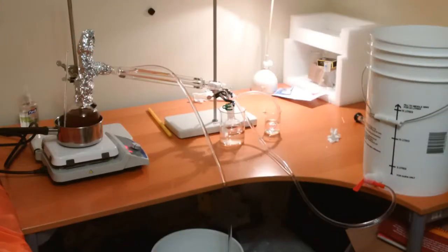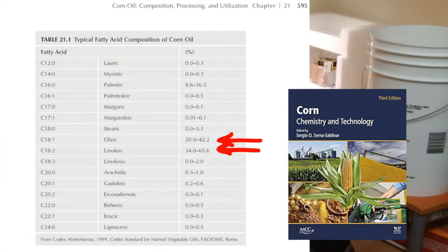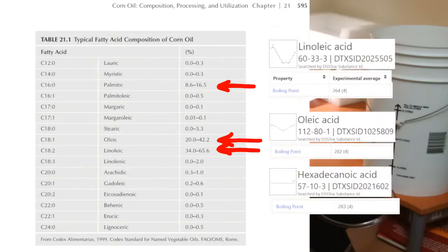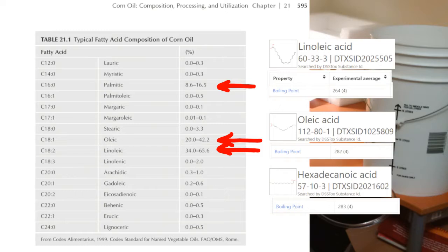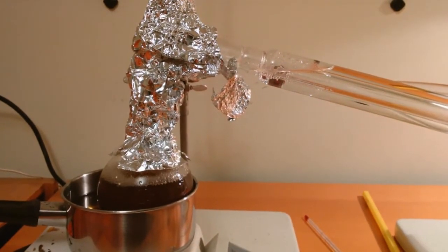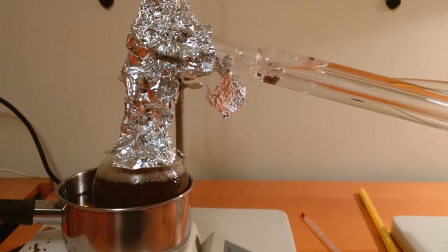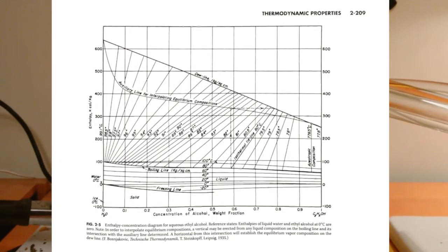On the bottom side, I placed a boiling flask in a hot bath full of Mazzola brand corn oil heated by a hot plate. According to the book Corn, Chemistry and Technology, published by the American Association of Serial Chemists, the main constituents of corn oil are linoleic, oleic, and palmitic acids. From the data at the Environmental Protection Agency's Comptox database, these materials have an atmospheric boiling point of 264, 282, and 283 degrees Celsius respectively, which means that I could get the beer to at least 100 degrees without the oil vaporizing into my bedroom. Here in the middle of the distillation, you can see that I achieved a rolling boil in the boiling flask. Watching this now, I believe I was boiling out a lot more of the water than was predicted by the chart, probably everything in this region.